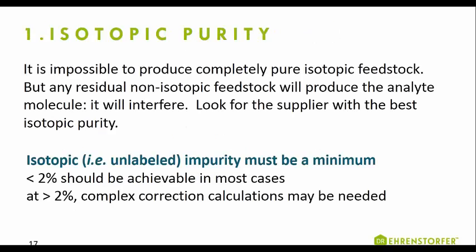The isotopic purity is quite an obvious one. Although I blithely said earlier that minor isotopes can be refined and purified, this will never be 100% efficient. So there will always be a small amount of a conventional isotope, and hence you will always synthesize a small amount of a conventional molecule, which you then add to all your samples.